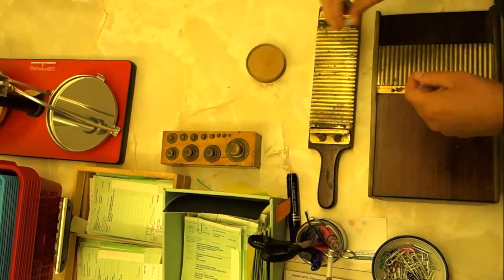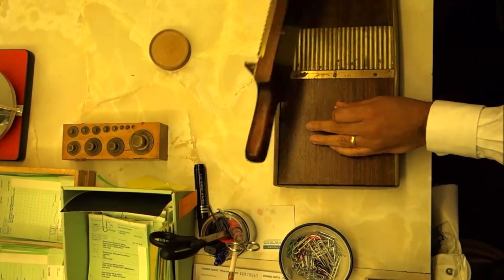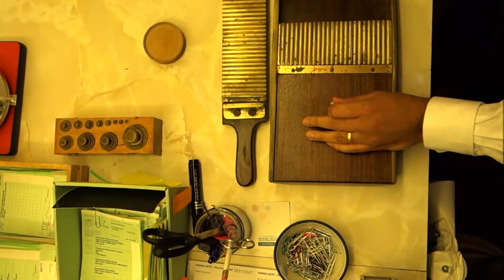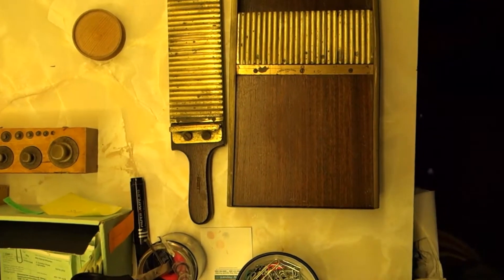This equipment is very old and is one of the first pharmacist's equipment. This is actually his - he's about 90 years old - and he used to use this to make up tablets and capsules.